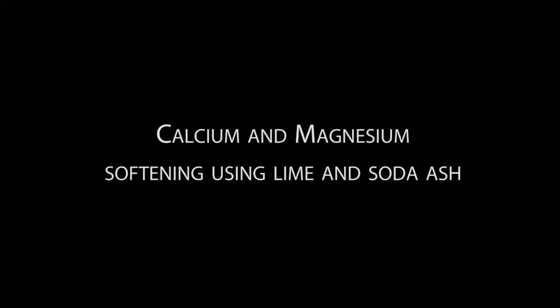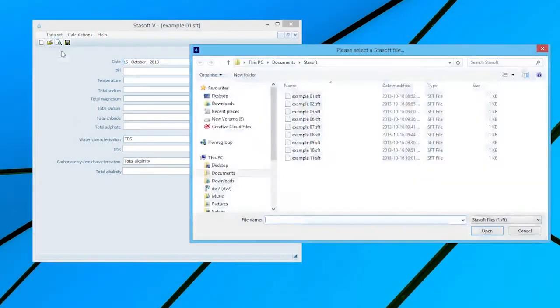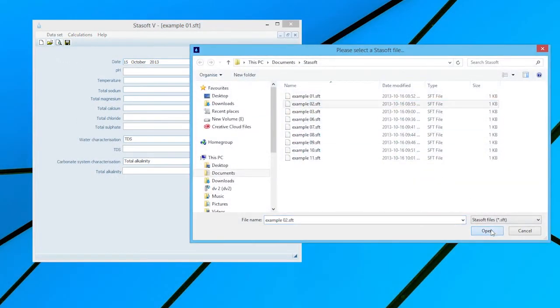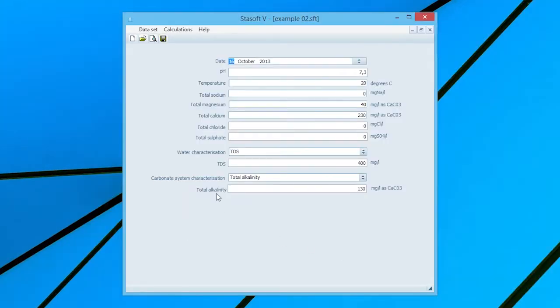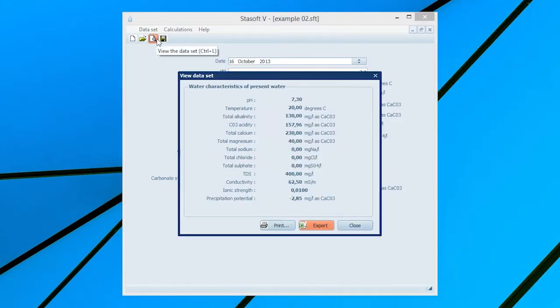Calcium and magnesium softening using lime and soda ash. Select Data Set 2 from Example 2 in the manual. Selection of the View option will bring up the window displaying the characteristics for the present water onto the screen.